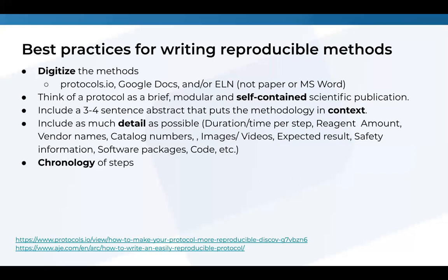And then another thing that's very important is to keep the steps in chronological order. So don't try to mix up the order, because it really is confusing and it makes it harder to follow. And then also try to limit jargon and use an active voice.